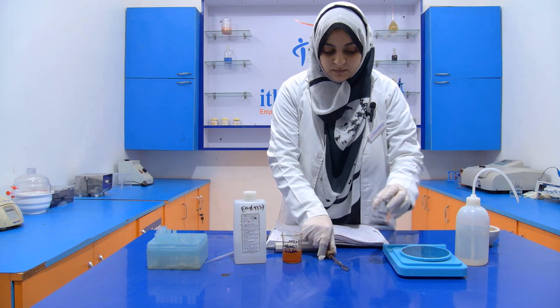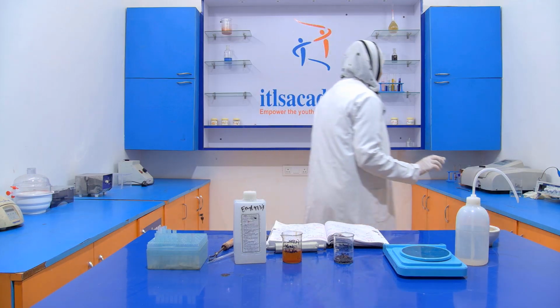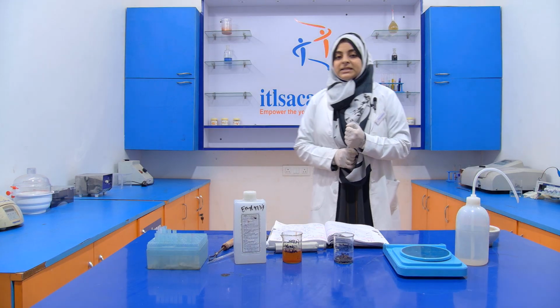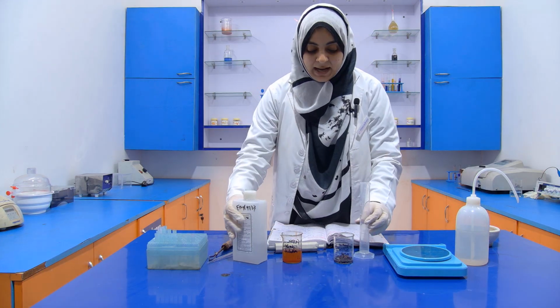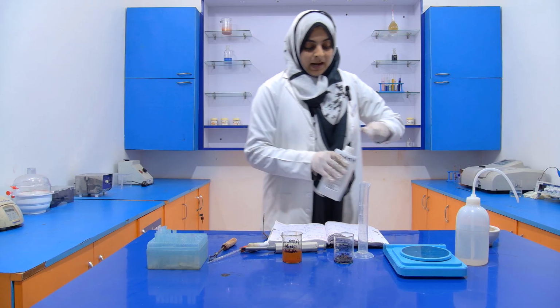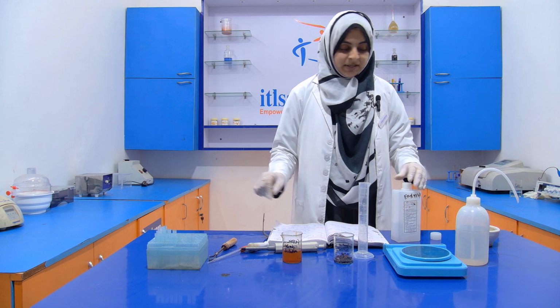Now add the ethyl alcohol. Now, how do we prepare this 97.2% ethyl alcohol? We take 97.2 ml of ethyl alcohol and make up the volume to 100 ml by using distilled water.